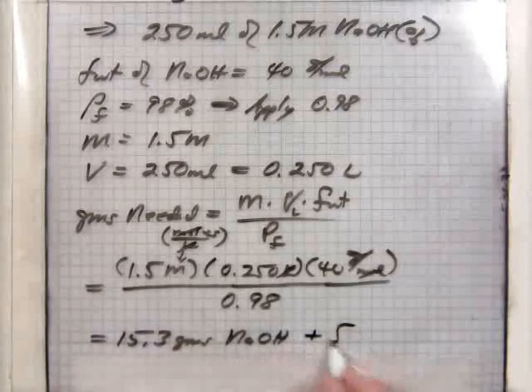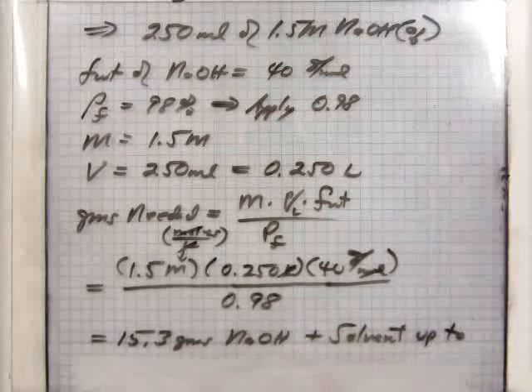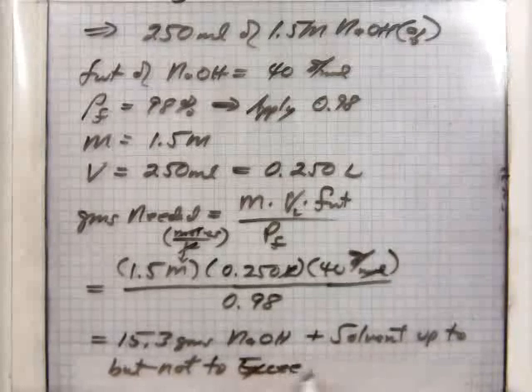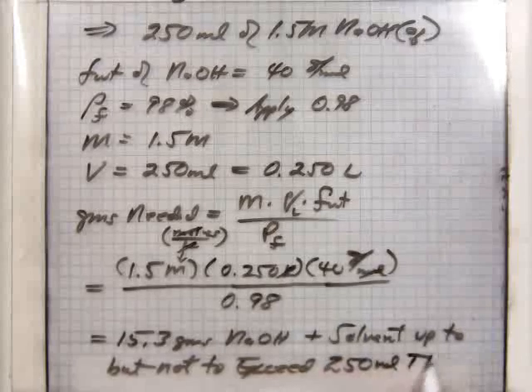Plus solvent up to, but not to exceed, 250 milliliters total volume.